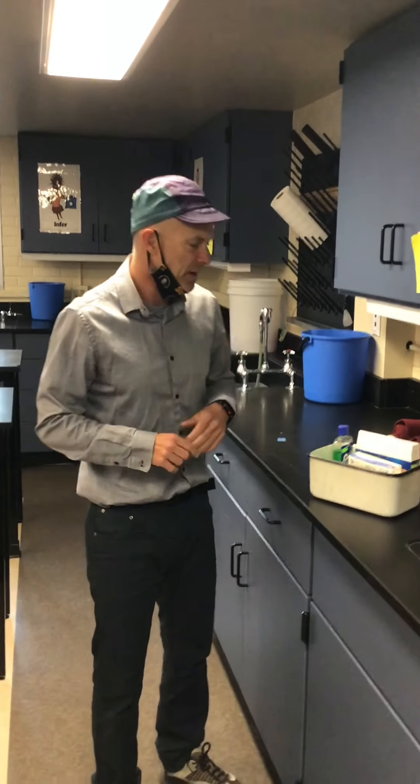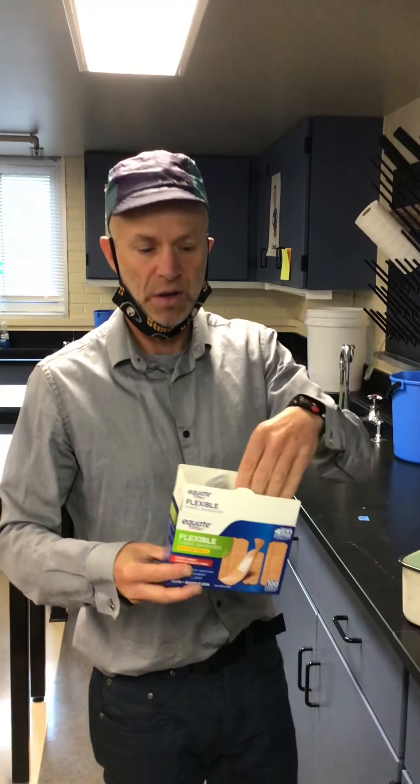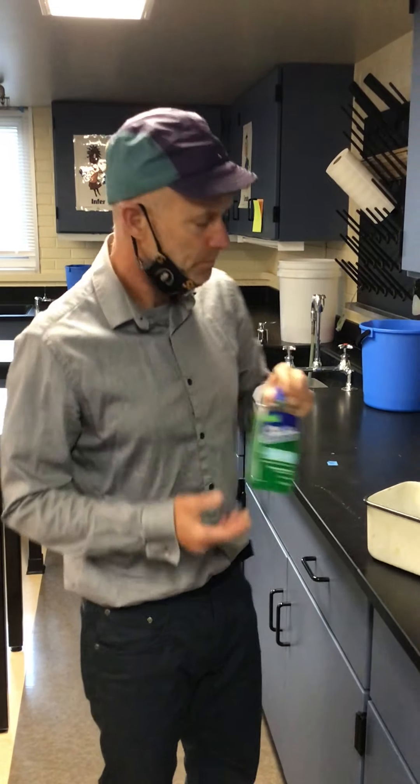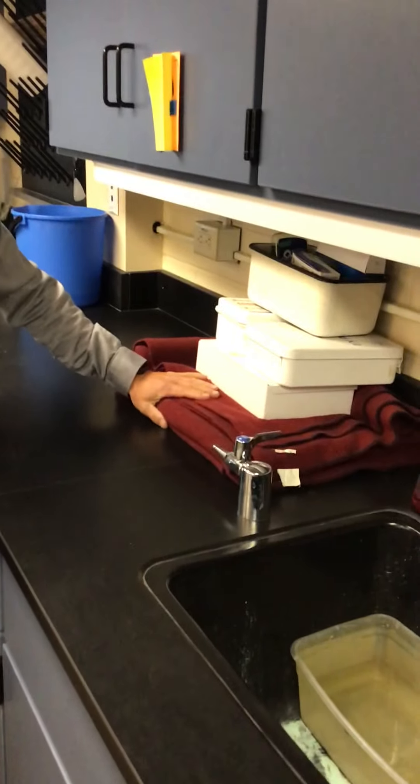We also have first aid kits, and the two most popular items in the first aid kit are the band-aids. If you cut yourself, and if you should burn yourself, we have some of this Solarcaine.